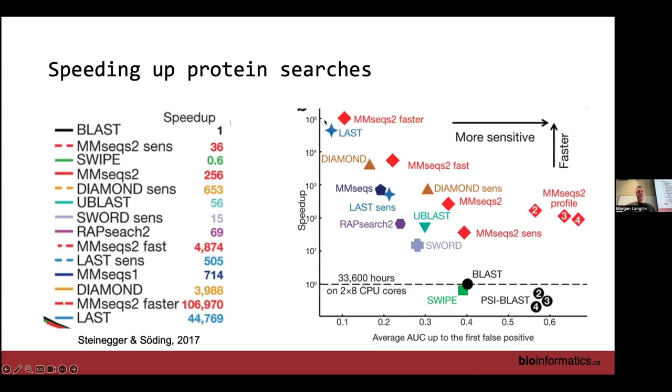I would say that's, to me, a pretty good bare minimum. Again, not everyone would do it. Does it really matter? Maybe not. But I think it's probably a good idea. Often those normalized gene annotations are reported as RPKM, which is reads per kilobase per million of sequencing. So sometimes you'll see that terminology within a microbiome experiment. All they're doing is normalizing per 1,000 bases, and then they're often scaling it to a million so you don't have super tiny numbers.